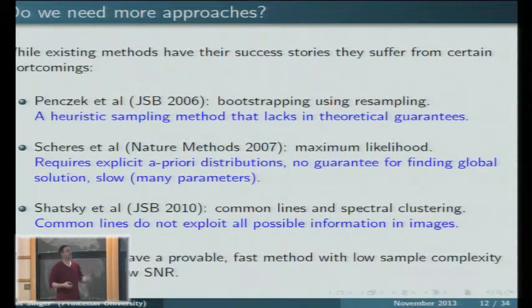So in resampling, you get 3D structures, but they actually correspond to nothing, because they're not any linear combination of actual volumes, or actual electric potentials. And also, when we resample again from the same images, there are going to be some dependencies, and then you do PCA. Who knows what you're going to get in this method?